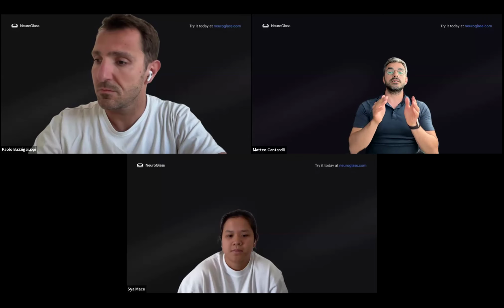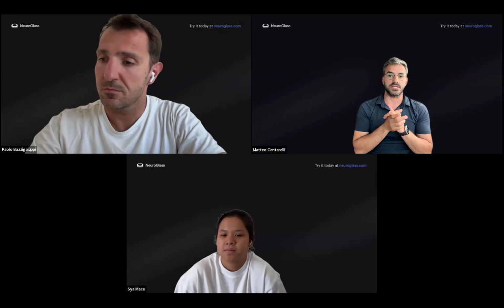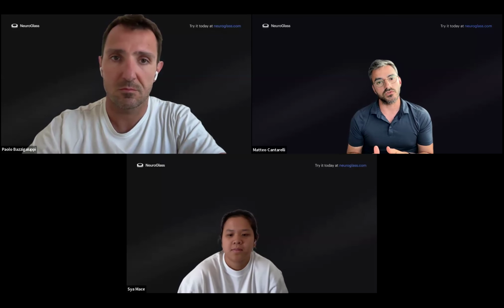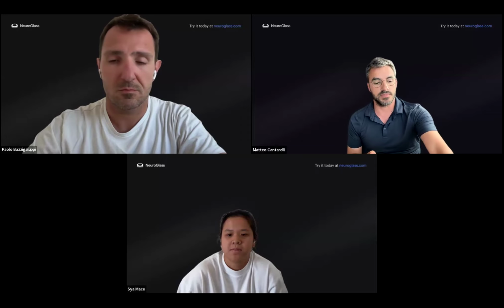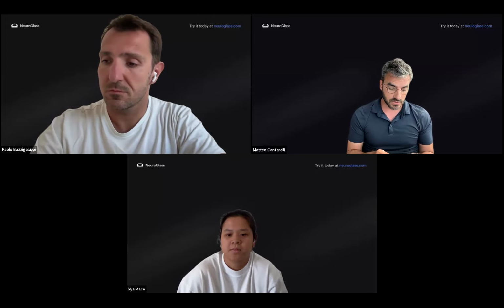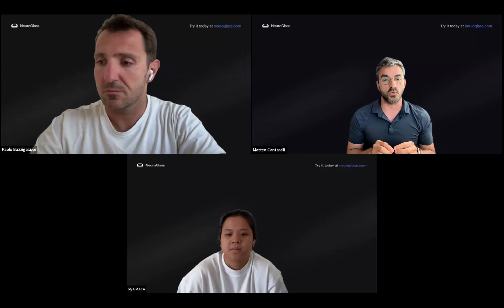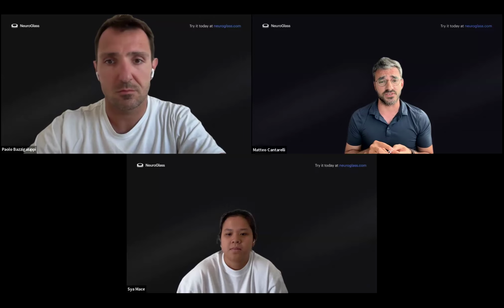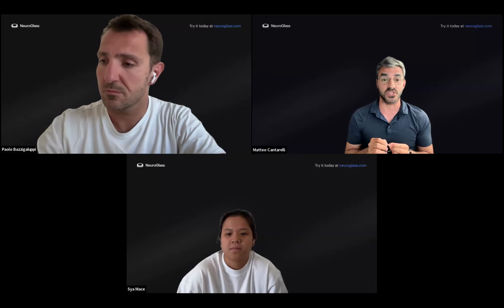Okay, so just a bit of background for how this started. Three years ago, as MetaCell, we started contributing to open source NeuroGlancer. NeuroGlancer was originally developed by the Google Connectomics group, and we started contributing in collaboration with the Allen Institute. I believe volume rendering is one of the first features that we contributed to.